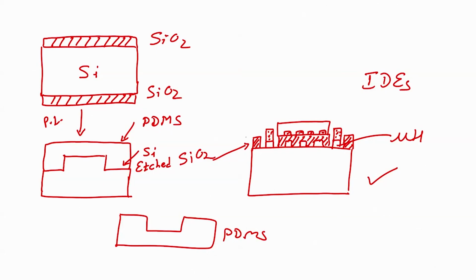Right, or if you want to have it like this, you can place it over here, correct. This is your PDMS. This makes your microfluidic chip. You got it, right. First step is a heater, next step is an insulator, next step is to remove the silicon dioxide from the contact area of the micro heater.